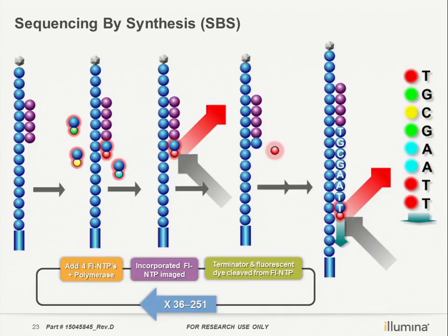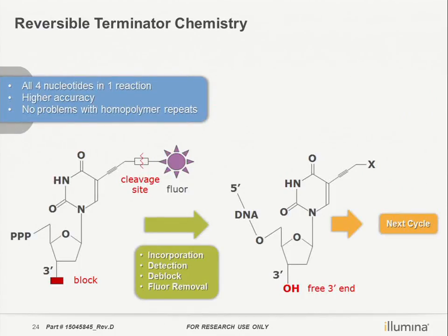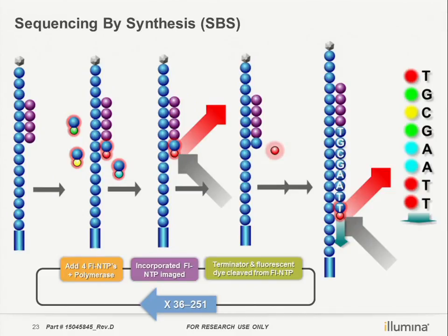Here, I just give you a brief sample. The sequencing length all depends on your application. For the NextSeq, the longest is 2 times 150 base pairs, so altogether 300 cycles. Is everything clear so far? Any questions? Of course you can sequence single read. For example, if I'm just doing RNA counting, I don't necessarily need to do paired-end sequencing, and of course you can do just one.